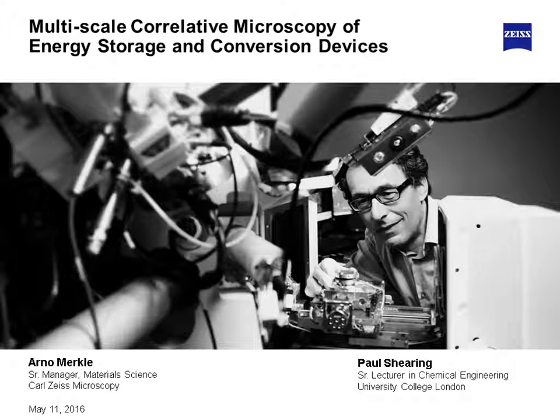Now that these correlative tools are so effectively combined in software like the Atlas V package that Arno mentioned, we're really excited to revisit our focused ion beam experiment and go for very, very high resolution images that will give us that finest length scale understanding of, for example, chemical decomposition.